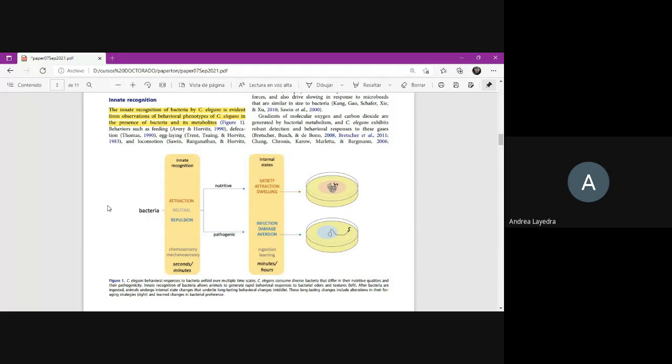While feeding on E. coli OP50, C. elegans alternate between active roaming states and inactive dwelling states, in which they either explore or exploit their food source, respectively. The proportions of time that C. elegans spends in roaming versus dwelling states is controlled by satiety levels, chemosensory inputs, and internal sensing of bacterial food ingestion.